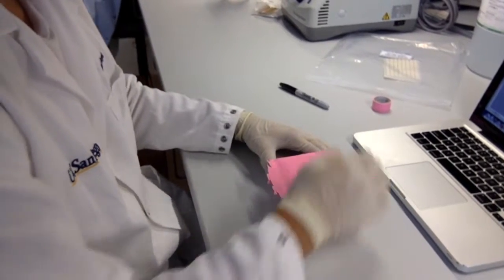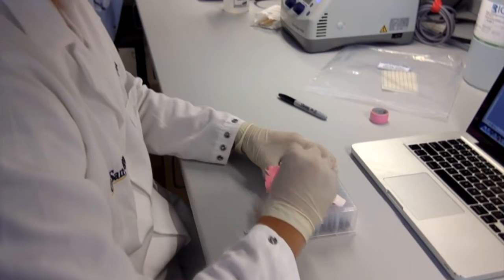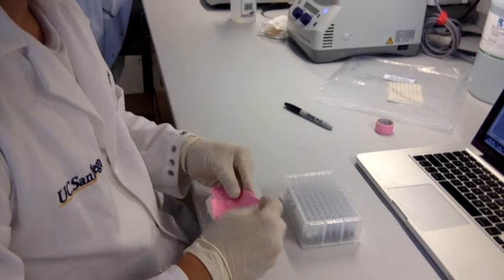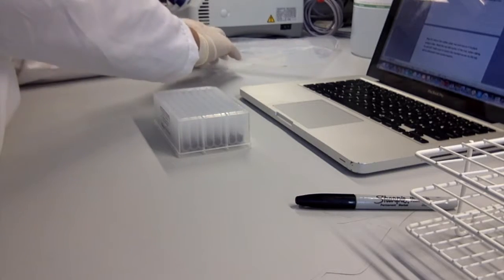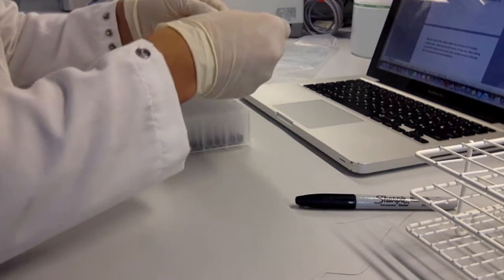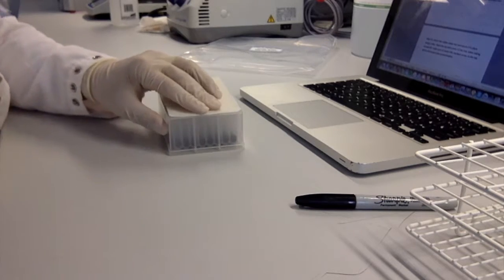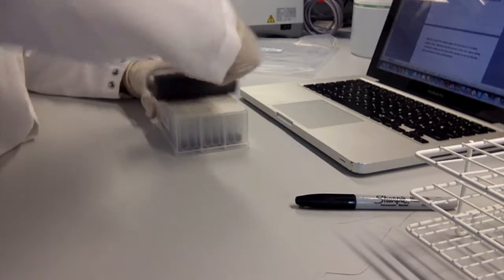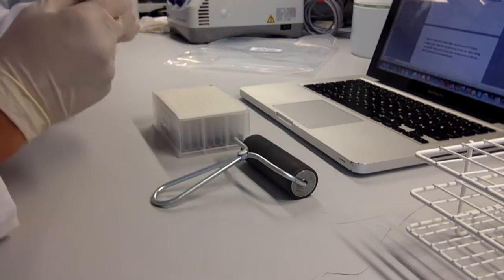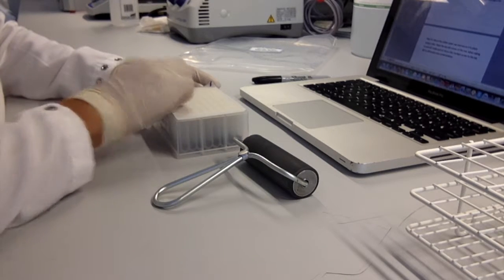Step 13: Once all wells are full, remove the tape. Do this step slowly as swabs may be stuck to the tape. Step 14: Return the rubber plate mat and secure it in place using a roller. Mark the top left corner of the mat. When taking the mat on and off, make sure to return this marked corner to the top left to eliminate cross-contamination.